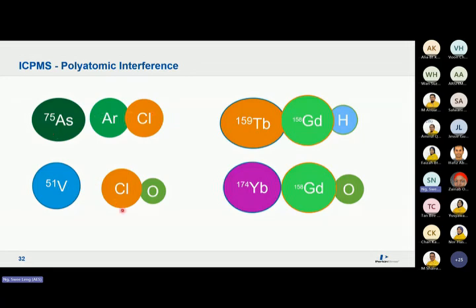Let's say you run the HCl, then your sample has HCl, or you digest with the HCl. So HCl has chloride, plus the water, you dissolve in water, you got oxygen. So this 35 plus 16 becomes 51. When you run vanadium in the ICP-MS, you will have this.